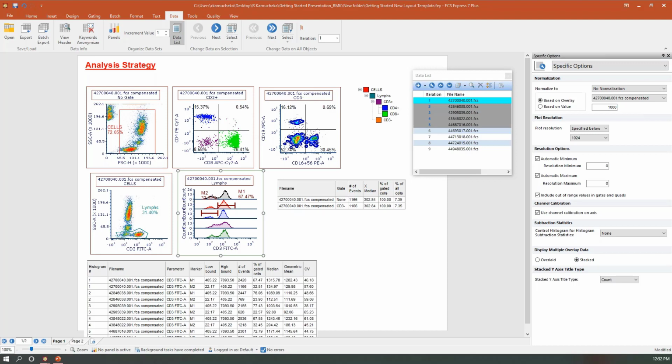So I see one of our users has put into the chat box that they have some problems creating PDF or PowerPoint with batch action, and they don't understand the problems. One of the most common problems I will tell you is these iterations. Because I just re-imported this data and our spreadsheet was a one-off element, and I haven't changed my overlays also, you can see that I've deactivated some of these iterations. And once they're deactivated, it won't run through the batch processing. So if I had 2 blue and the rest gray, I would only get 2 iterations from here. Also, whenever you start a batch process, make sure that you're on the first iteration so that it can run through all of those other iterations. Those are 2 of the most common things that I see.